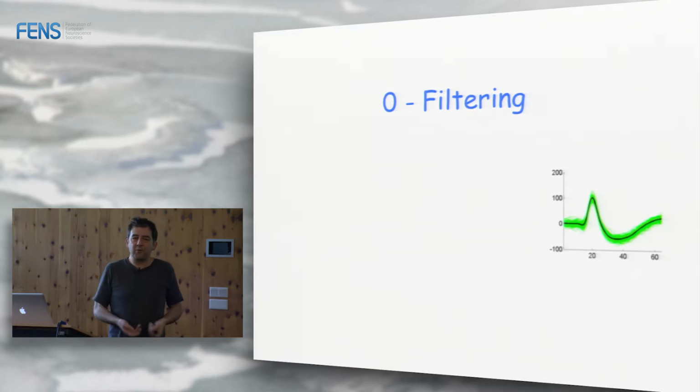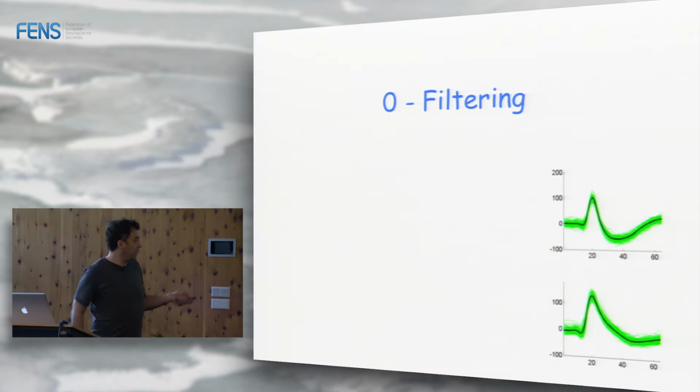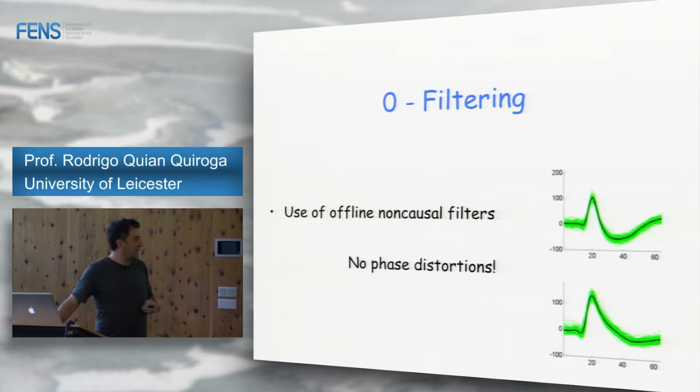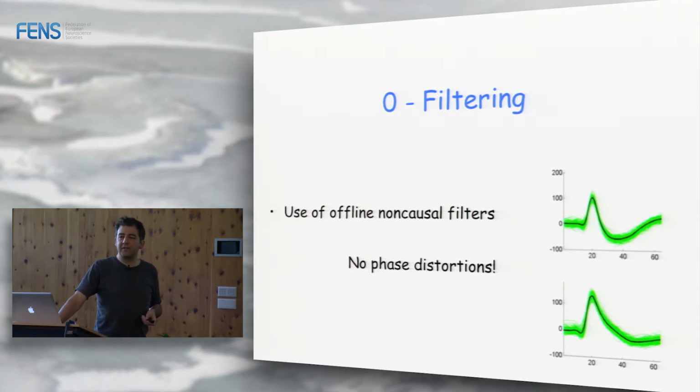I mean, for me, everything was wrong. I didn't understand what was happening because my spike shapes looked like that. And I'm like, that's a funny triangle. Doesn't look like the spikes I see in books. The spikes I see in books have this rebound here, which I never found. I never saw that. Actually, it happens, but it's very rare. Now, what it took me some time to realize is that all the spikes I was seeing in books are actually filtering artifacts. They're not like that.